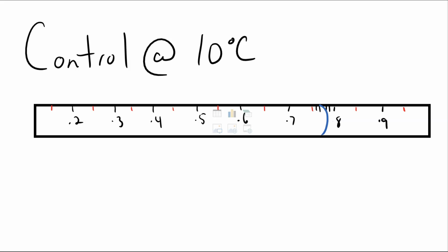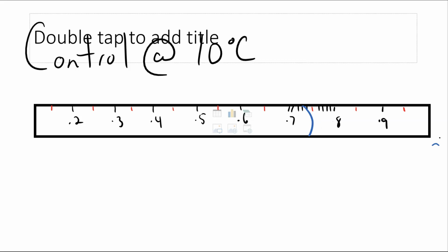So there it is, 5 minutes, and I forgot to write that, but I'll go ahead and say it. So you place it in the water at 0, that's your initial reading. There it is at 5 minutes. There it is at 10 minutes. There it is at 15 minutes. There it is at 20 minutes.